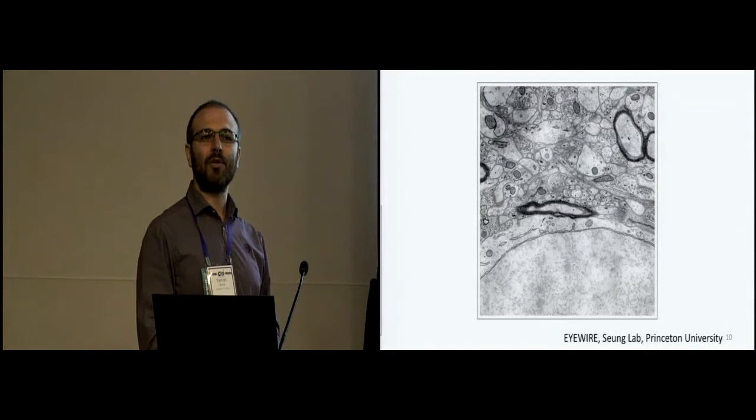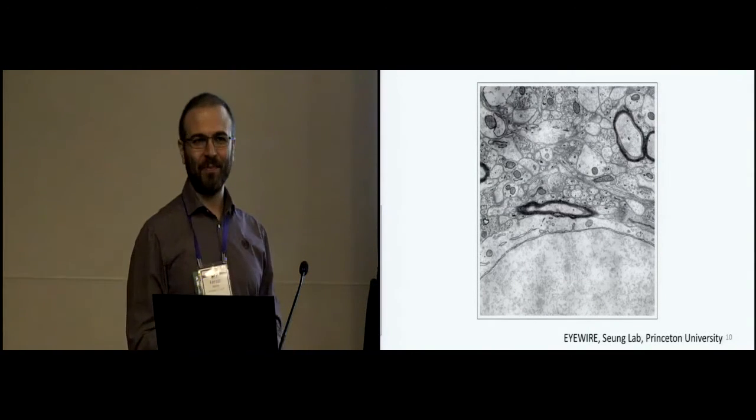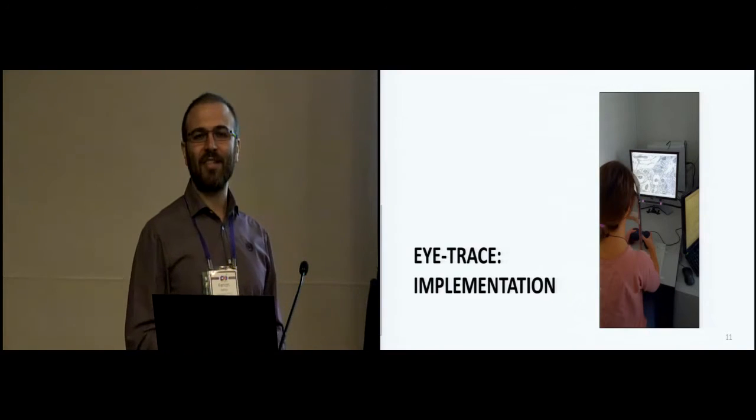Were you able to follow the cross-sections with your eyes only? Maybe a few hands? Okay, thank you. We had this same intuition, and with this motivation, we implemented our iTrace system.